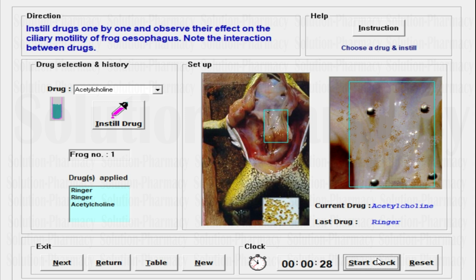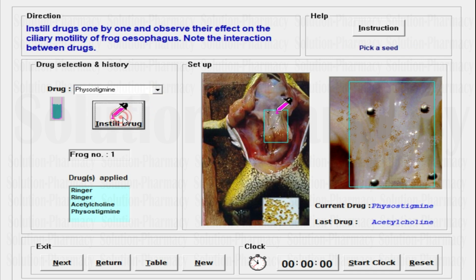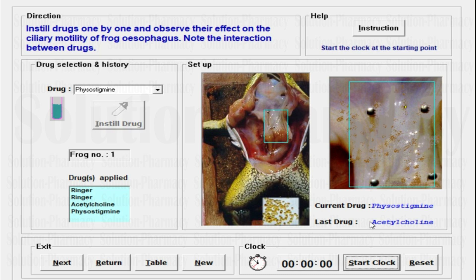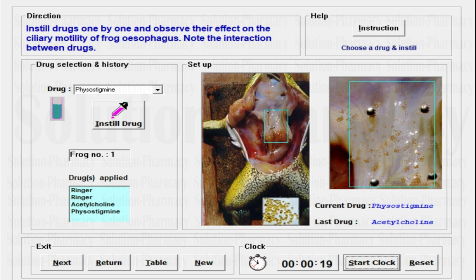We are going to do the same process with the next drug. Click the Reset button, then go to the menu and select physostigmine. Instill the drug, select a seed, drag it toward the starting point, release it, start the clock, and note the time taken to fall from the starting point to the end point — that will be the effect of physostigmine. Motility is very important especially for the esophagus and other organs associated with the digestive system. The seed falls quickly — 19 seconds, which is very fast. The effect of physostigmine is increasing the motility of the esophagus, which is much lower than the previous two drugs.